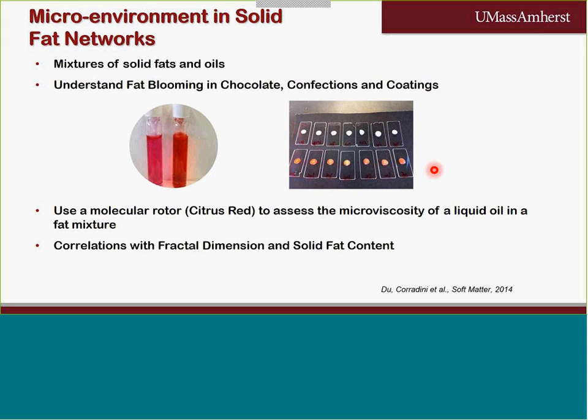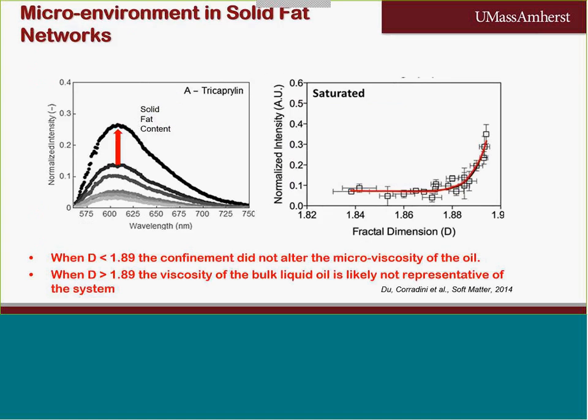So you can see that as the solid fat content increased, so did the normalized fluorescence intensity. But what's more interesting, when we calculated the normalized intensity as a proxy for the microviscosity of the oil entrapped in a crystal network, it typically shows two regimes. One is below a fractal dimension of 1.89, which means that the confinement did not alter the microviscosity of the oil.